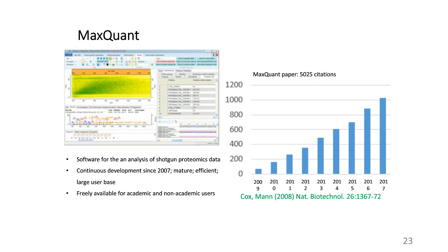And so the license model is that there is none. So it's really available for everybody, which also includes companies who can make use of MaxQuant and also of the enhanced features that we have integrated now for the timsTOF Pro without any charge.